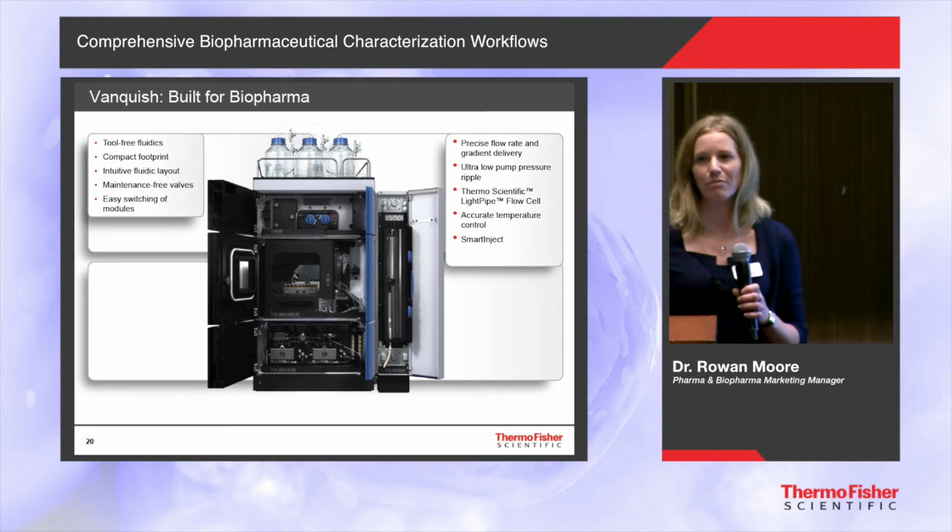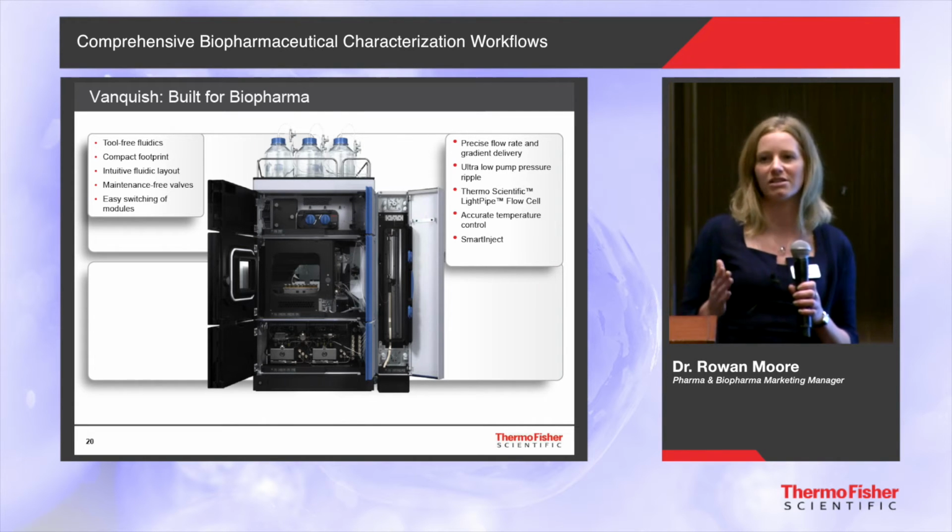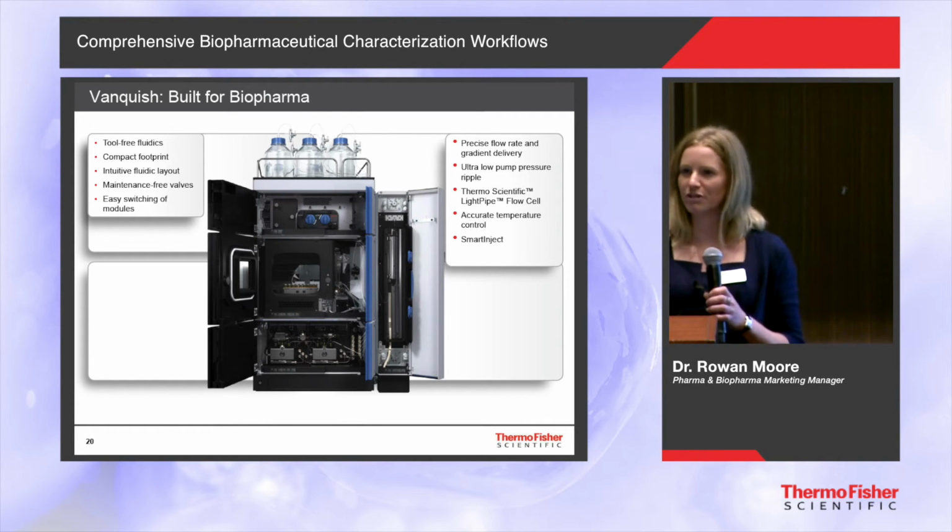And this is really important in biopharma. If you transition from LC-MS to LC-UV, you need to be confident that that retention time is for the same molecule.